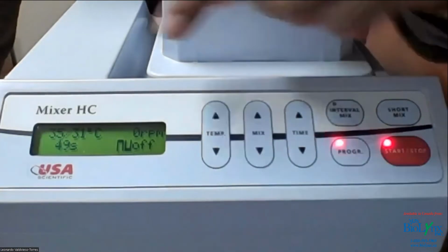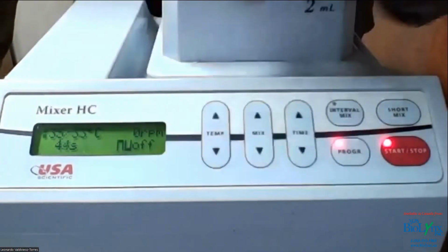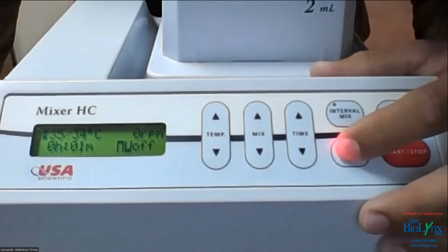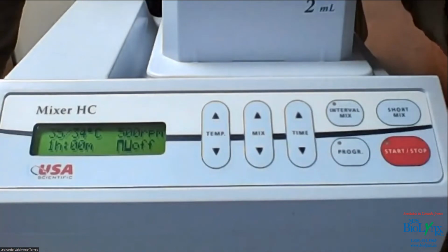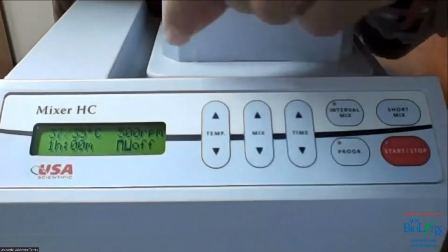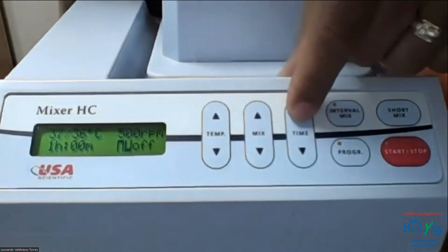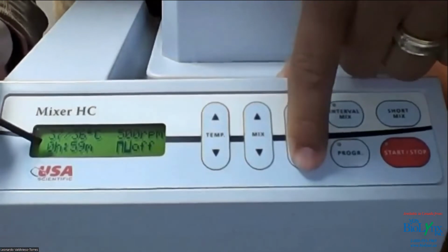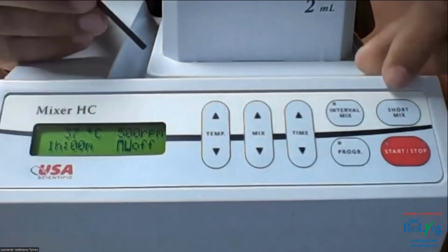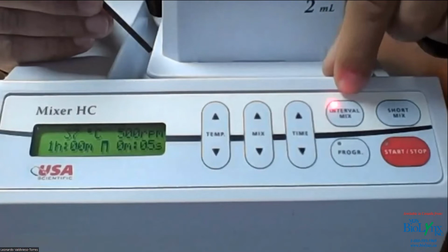And for that, we don't need the programming function. So I'm gonna turn it off. You see now that it's going to the second step and it's beeping, the 2 steps is blinking. But I'm gonna stop it to go into the other setting. So I'm gonna turn off the programming function. And now I'm gonna go to 37 degrees Celsius here. You can adjust the time. You can see how it changed the time, right? So I'm gonna leave it for 1 hour, 37 degrees Celsius. And I'm gonna turn on the interval function, which is right there. You see it turned red.